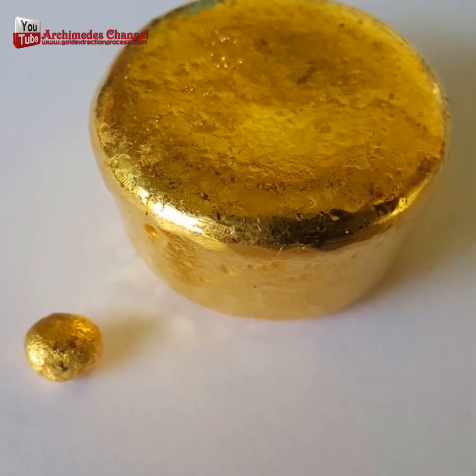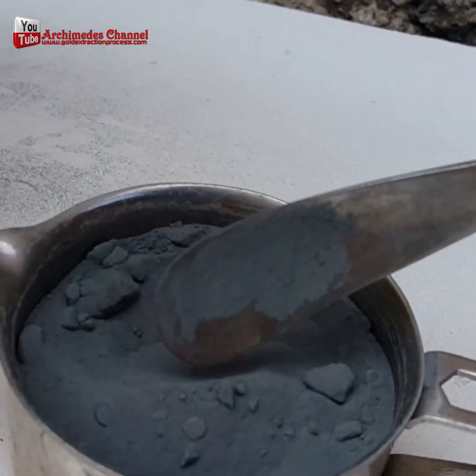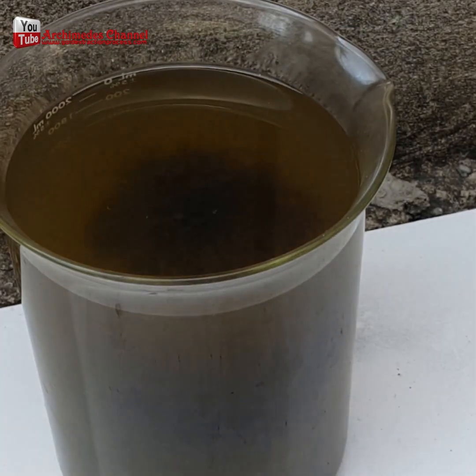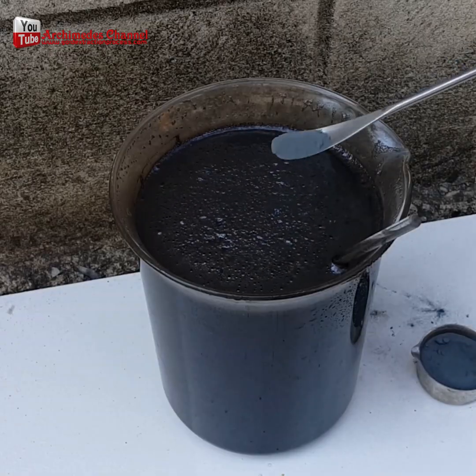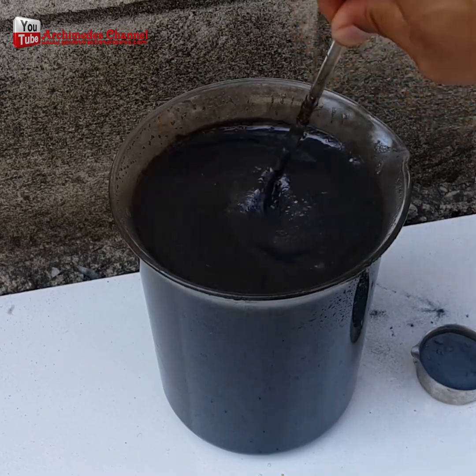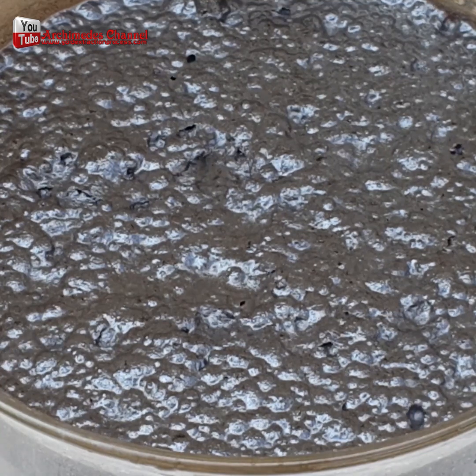Now, when dealing with the chemical water used in processing the gold, you'll need some zinc powder. Add just a little at a time, carefully, until you've saturated the solution. And of course, be careful — work in a well-ventilated area. Wear your safety equipment, and just watch what happens: it starts to bubble and swirl.